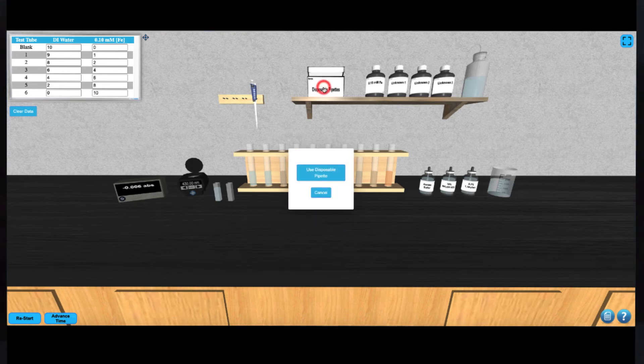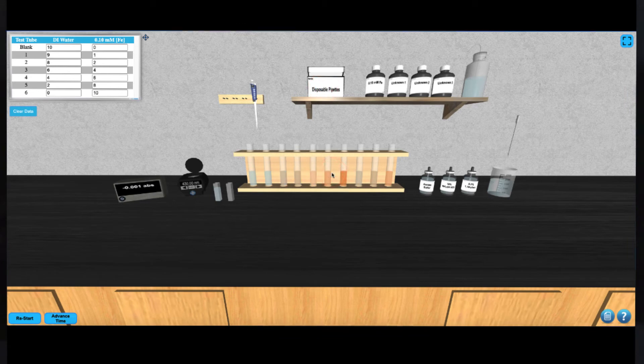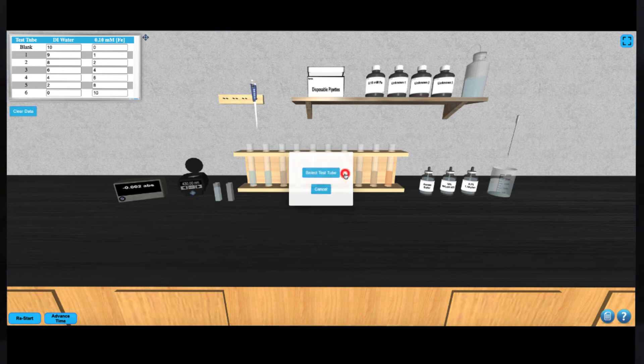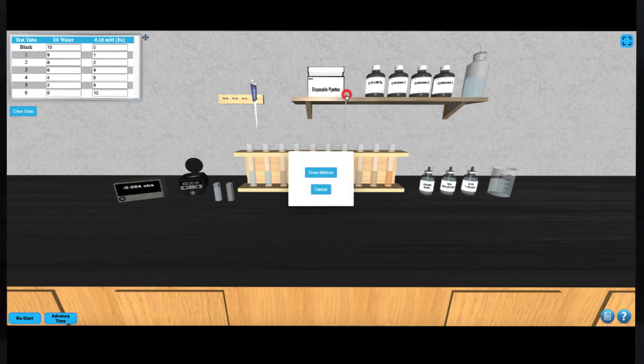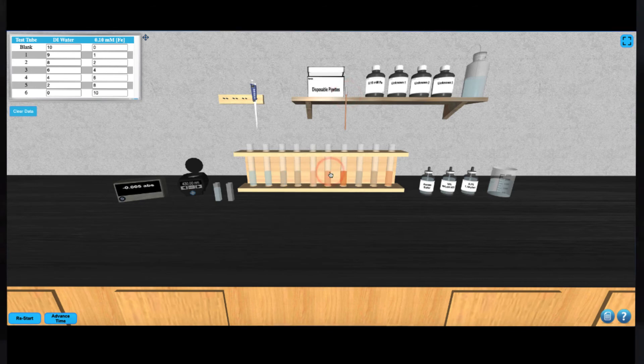First, click on the disposable pipettes on the shelf to select one. Then, click on the test tube you'd like to read the absorbance for. Click the pipette again to draw up the solution, and click the clean cuvette to dispense this solution into it.